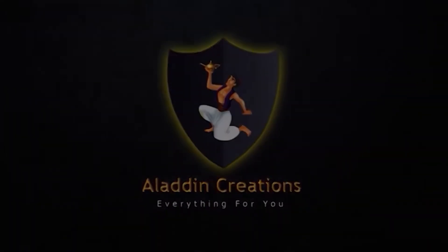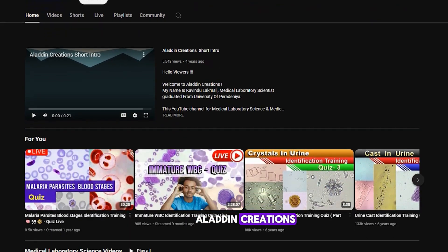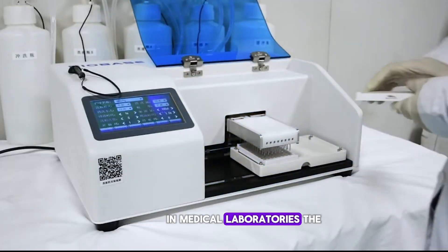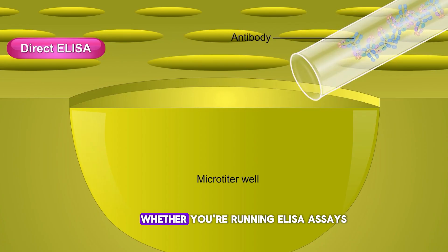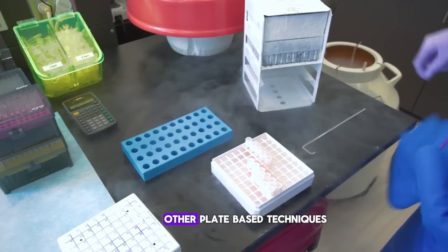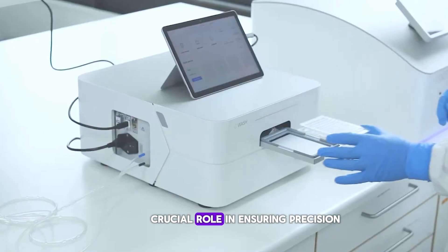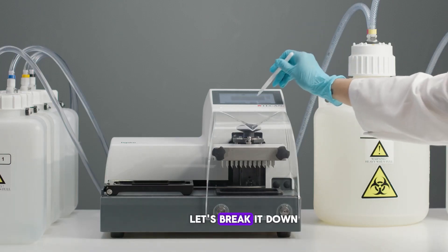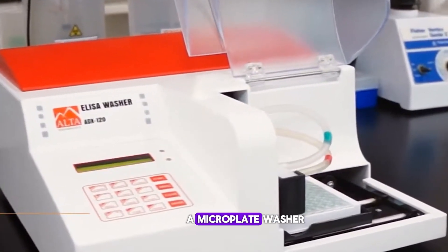Aladdin Creations — hello and welcome to Aladdin Creations. Today we're diving into a vital piece of equipment in medical laboratories: the microplate washer. Whether you're running ELISA assays, cell-based experiments, or other plate-based techniques, this tool plays a crucial role in ensuring precision and reliability. Let's break it down — so what exactly is a microplate washer?